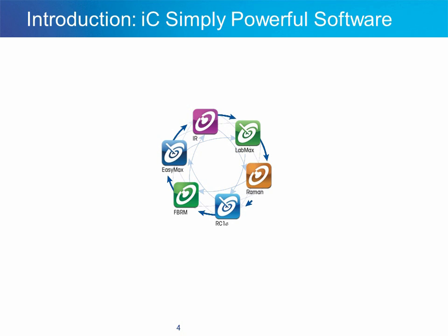We have developed modules which we refer to as D2I modules, which stands for data to information. We use chemometrics to simplify data analysis and to make it easy for non-specialists to get the full value out of our technologies.